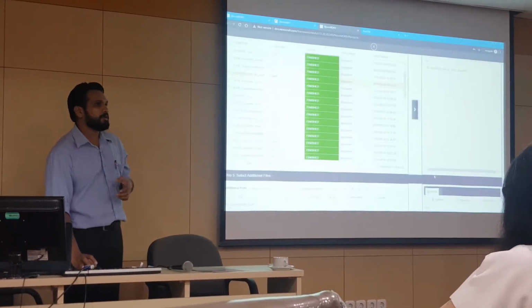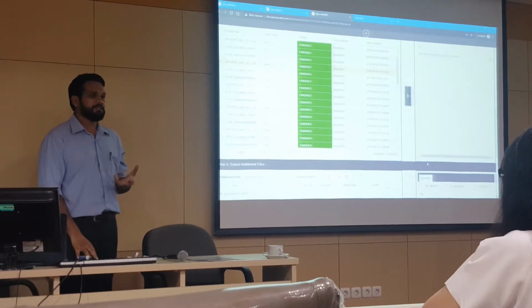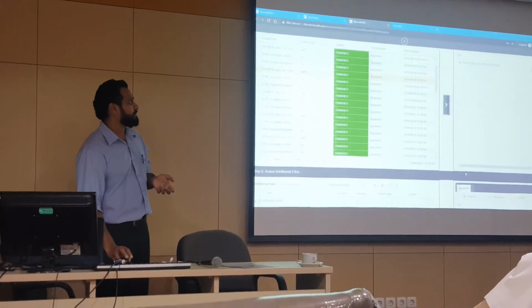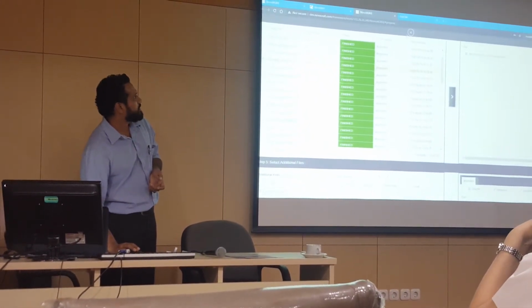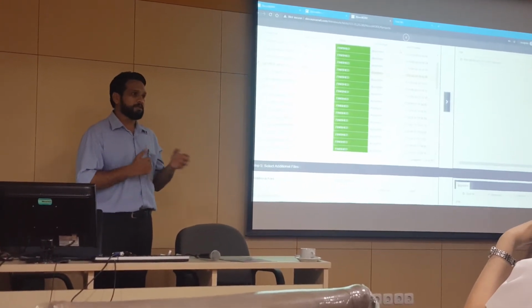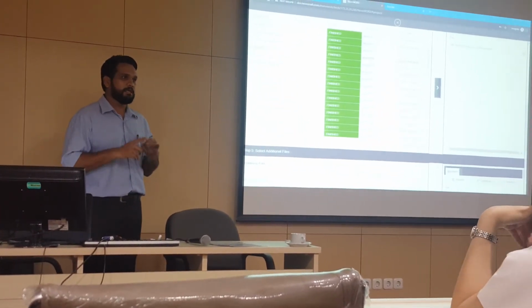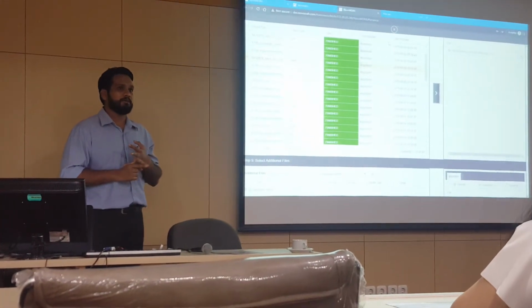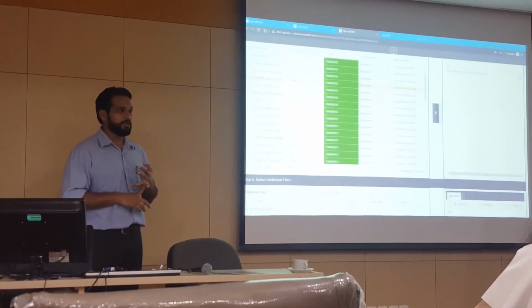Some protocols require additional files for you to run. A list of these additional files is actually in the protocol help guide. We have a list of guides that we use, that we've listed out in the home page. I'll show you later. This has the entire flow of all the projects, all the protocols. You can refer to that in terms of what inputs it takes, what outputs it produces. Sometimes, depending on the protocol, it even gives you how to interpret and analyze the outputs. How do you read the outputs?